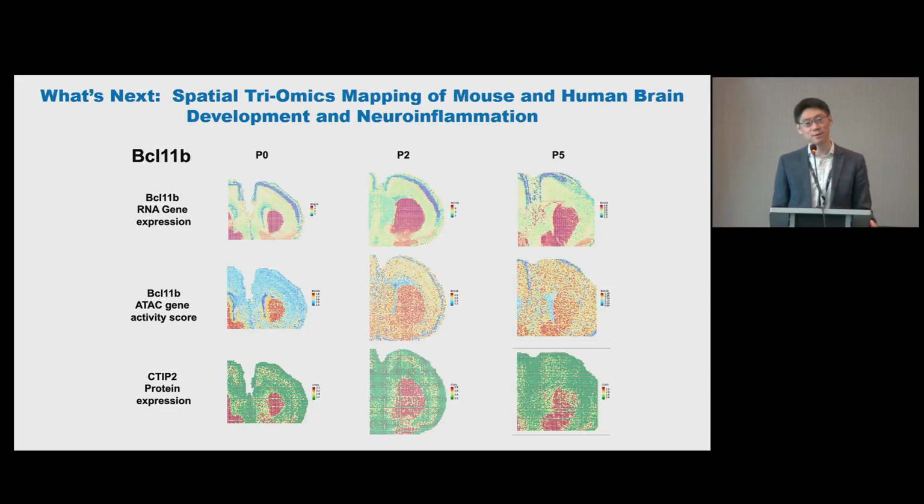Recently, we said that at least in some cases, for example neuroinflammation, you want to look at a lot of immune genes and the surface markers associated with different immune cell types. Can we get all of them together, the protein, transcriptome, and epigenome? I just want to show you that it's doable, and it works out quite well. But we were working on this for brain samples, and most of the gene markers we demonstrated in the Nature Biotech paper are not so relevant, so we included a couple more markers specific to the brain. This is one of those, and you can see from the protein data, the epigenome, and the transcriptome very consistent results.